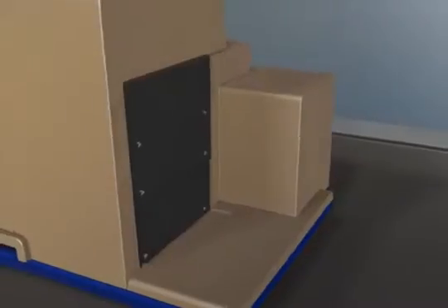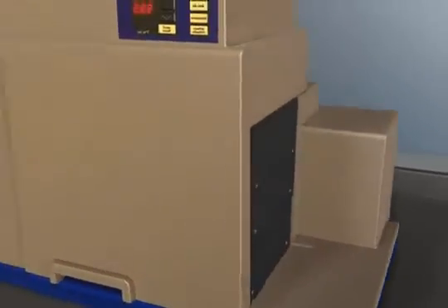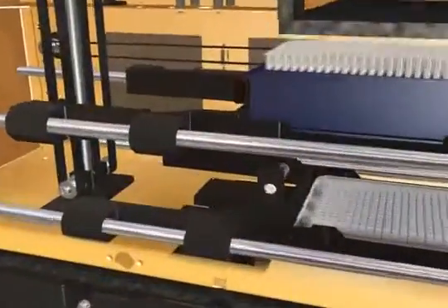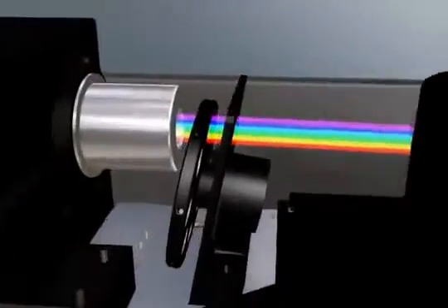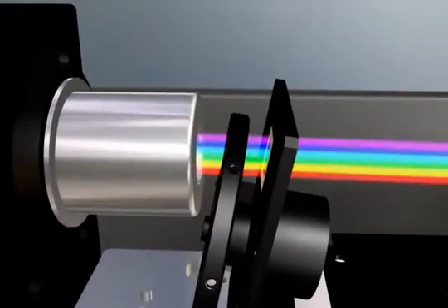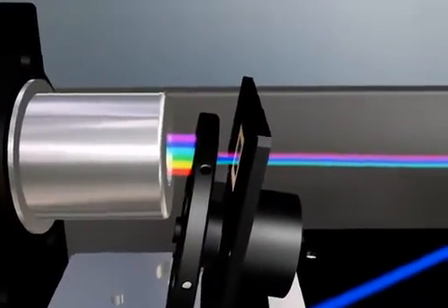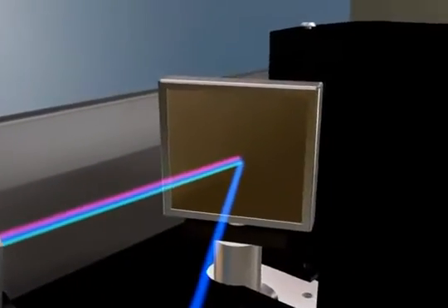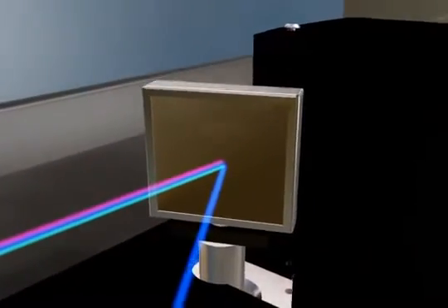The FlexStation 3 system is based on the SpectraMax M5e multi-mode reader and uses monochromator-based smart optics to select the desired wavelengths for your assay.